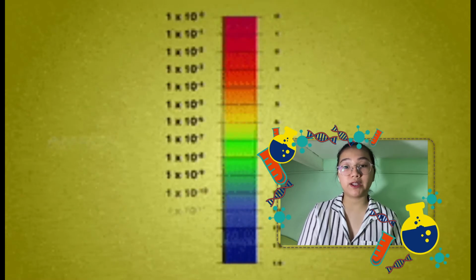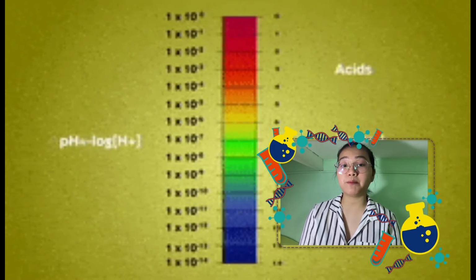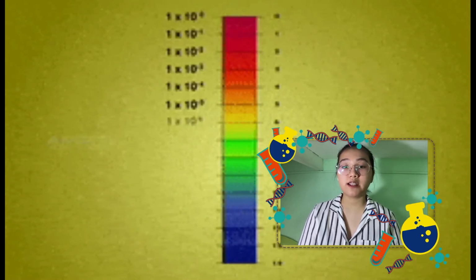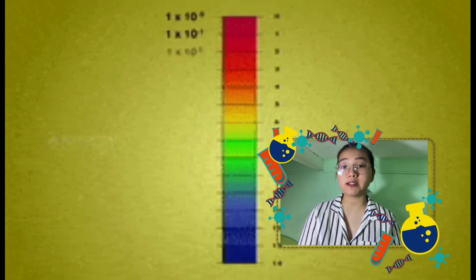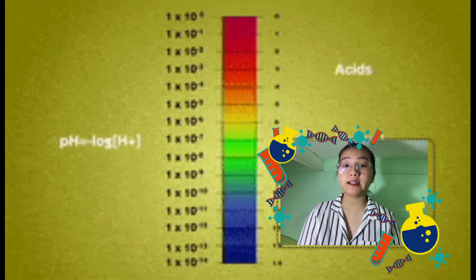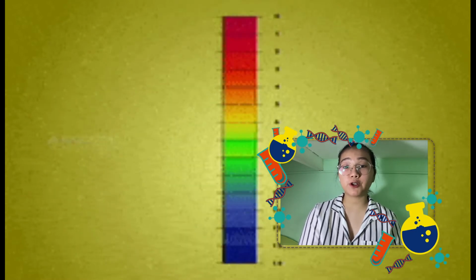The importance of indicators is that they detect the endpoint of titrations. This means when a certain concentration of the acid or a base is completely neutralized, then at the endpoint, we observe a color change. Now that you have an idea about the concept and importance in this experiment, we will now proceed to see the process of the experiment that was performed by Aina Ragasa, and later on, Lester Guevara will discuss the result observation.